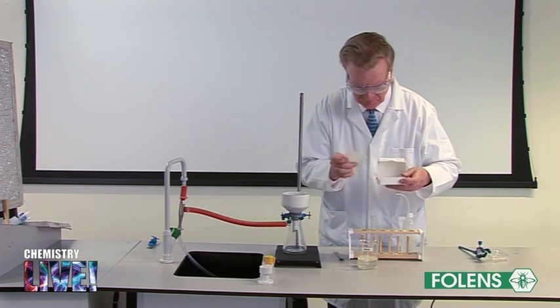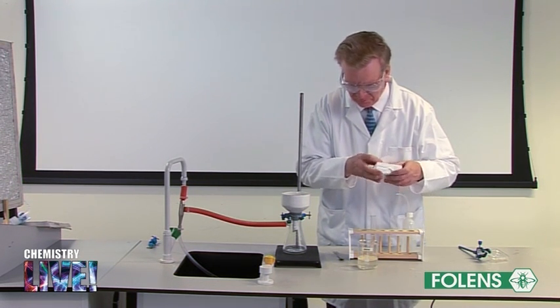Filter off the soap using a filter funnel or a Buchner flask and filter paper.